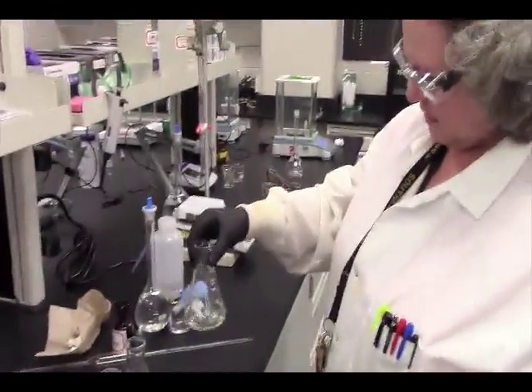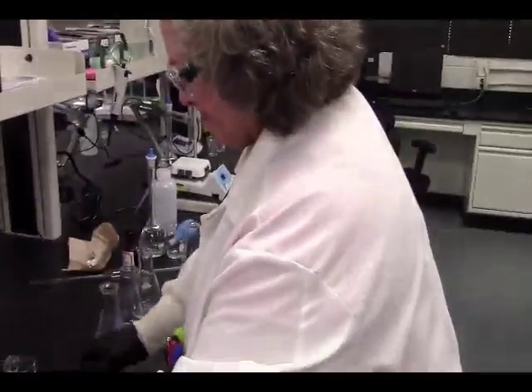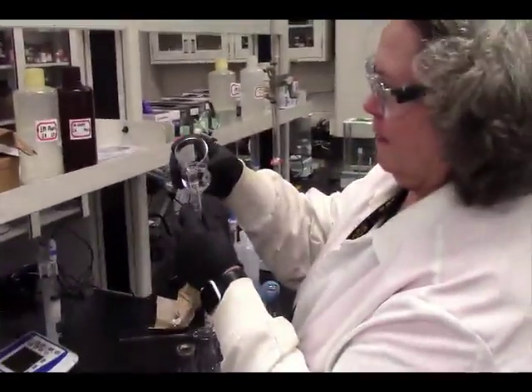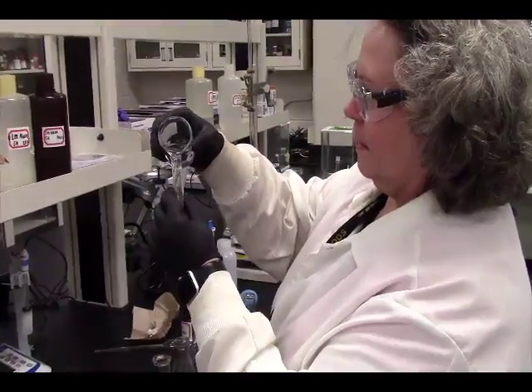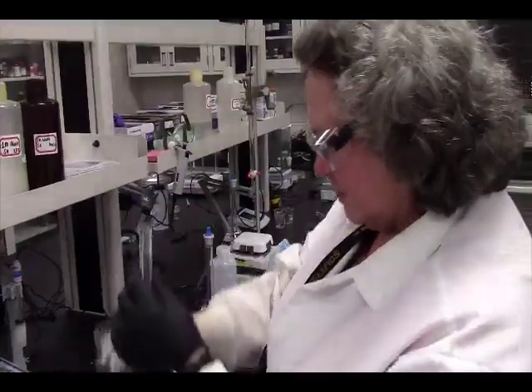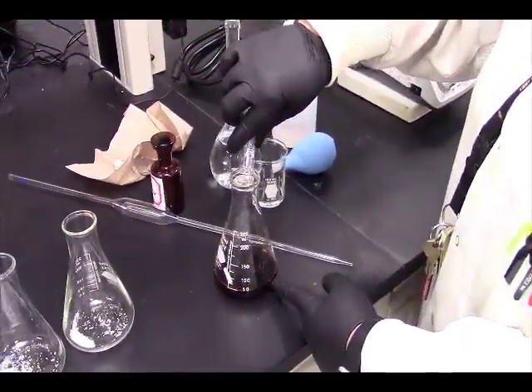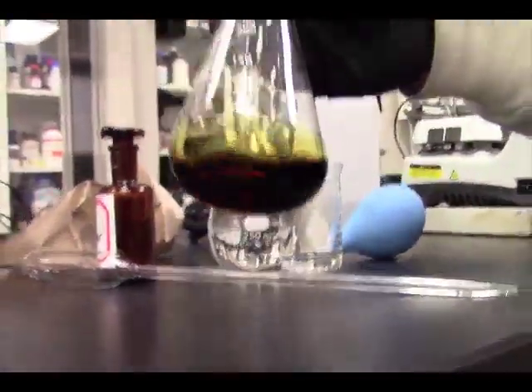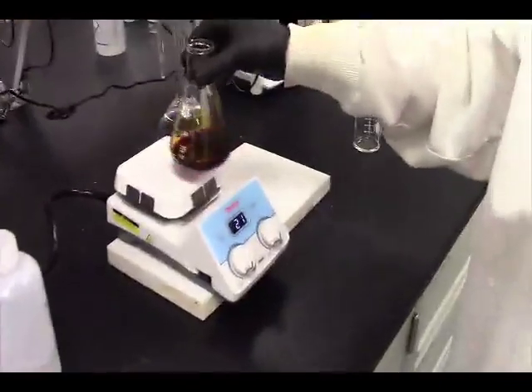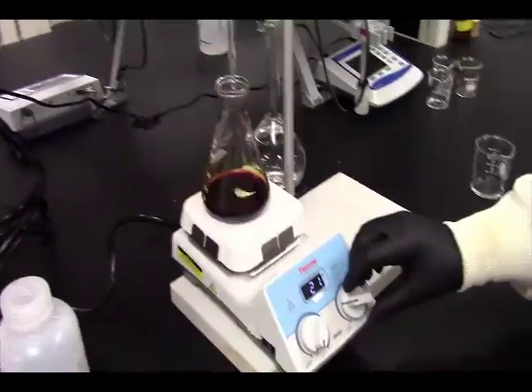All right, so here we have our KI mixed with our iodate. Going to add about 10 milliliters, and our procedure says about 10 milliliters, so you notice I'm not using a volumetric pipette for that, because it's about, and we should get this dark brown color. And I will show you why it's dark brown when we go through our calculations.